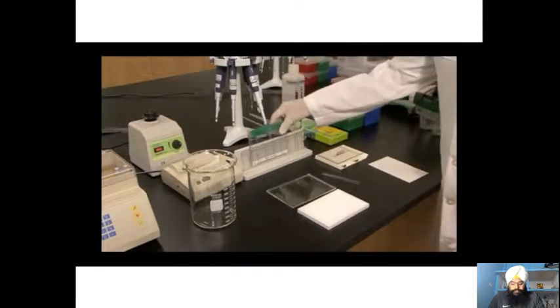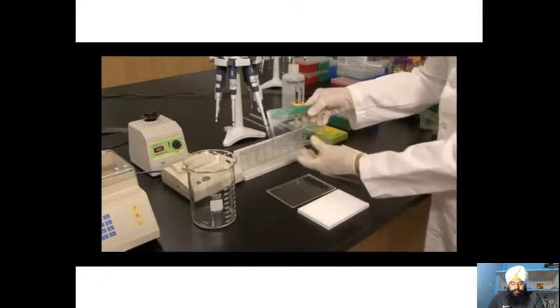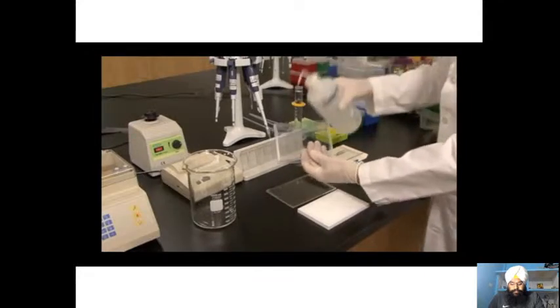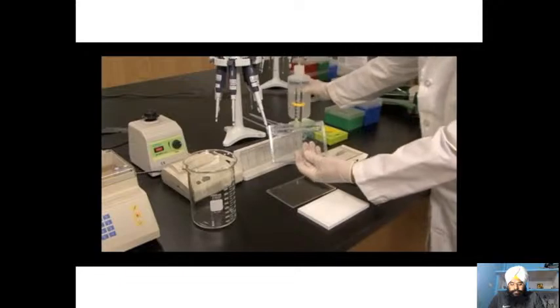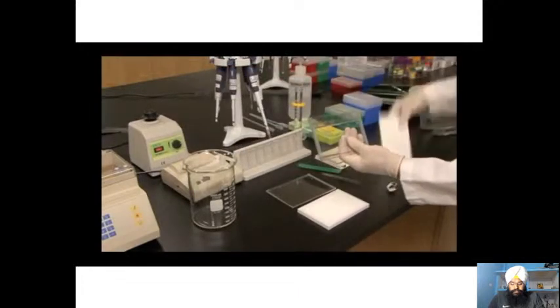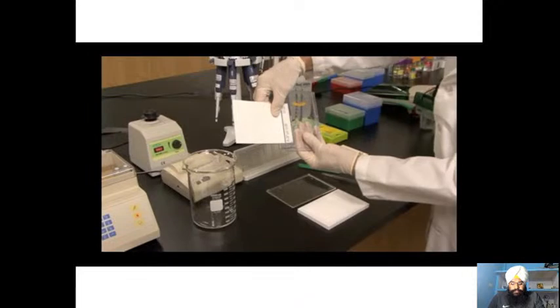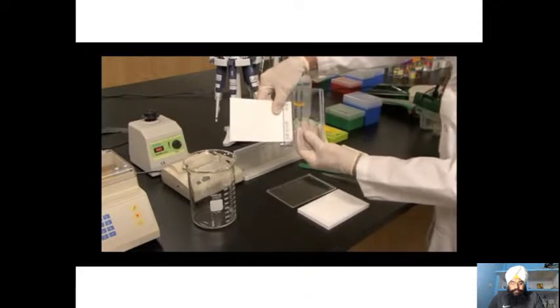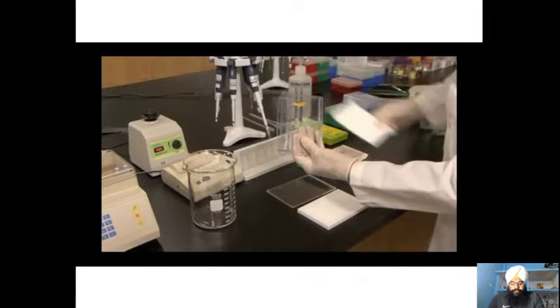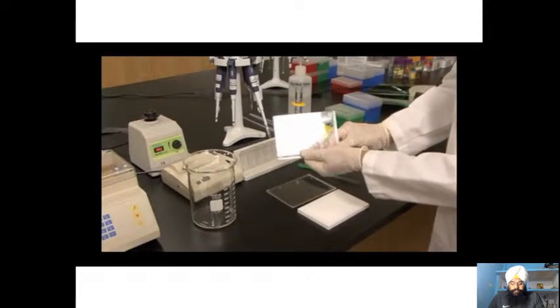Prepare the gel by removing the sealing tape from the bottom of the gel and slide out the comb from the top. Rinse the wells with good quality DI water. Tap the water out into a beaker and then place the gel sideways and remove the excess water from the wells with a piece of filter paper. Be careful not to touch the bottom of the gel as it can damage the surface of the second dimension gel. We usually do this because unpolymerized acrylamide can cause anomalies in your second dimension gel if it's not removed.